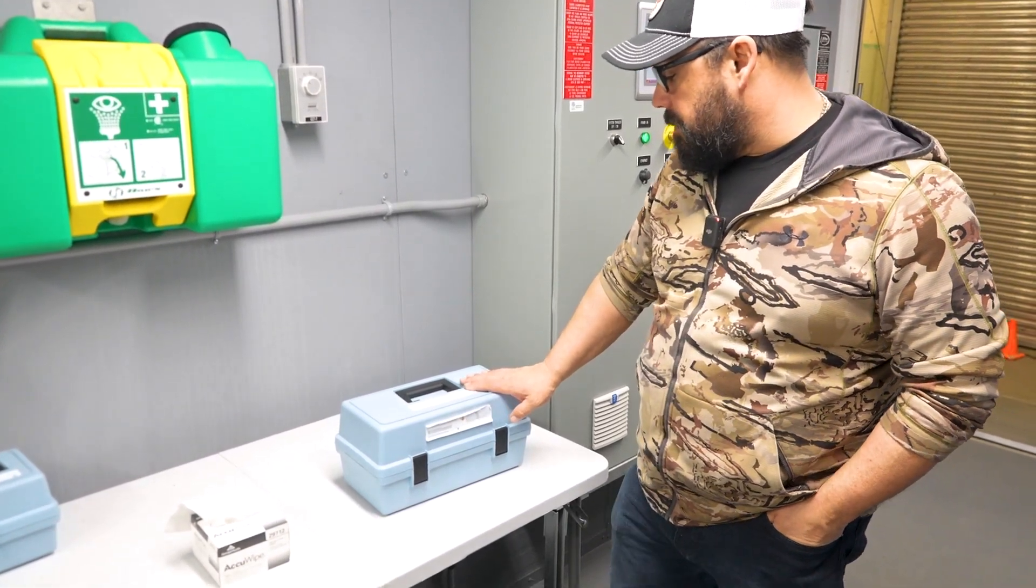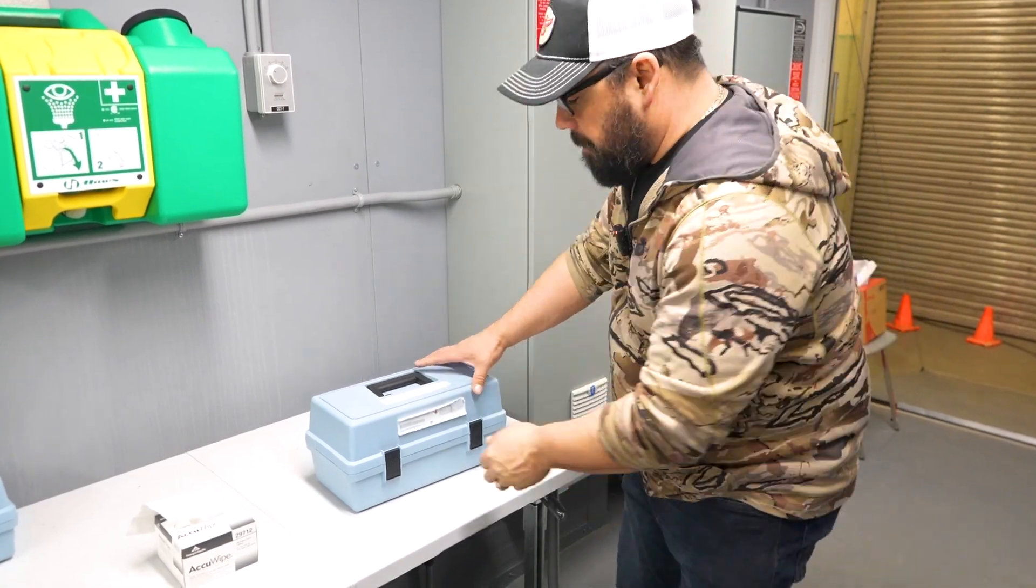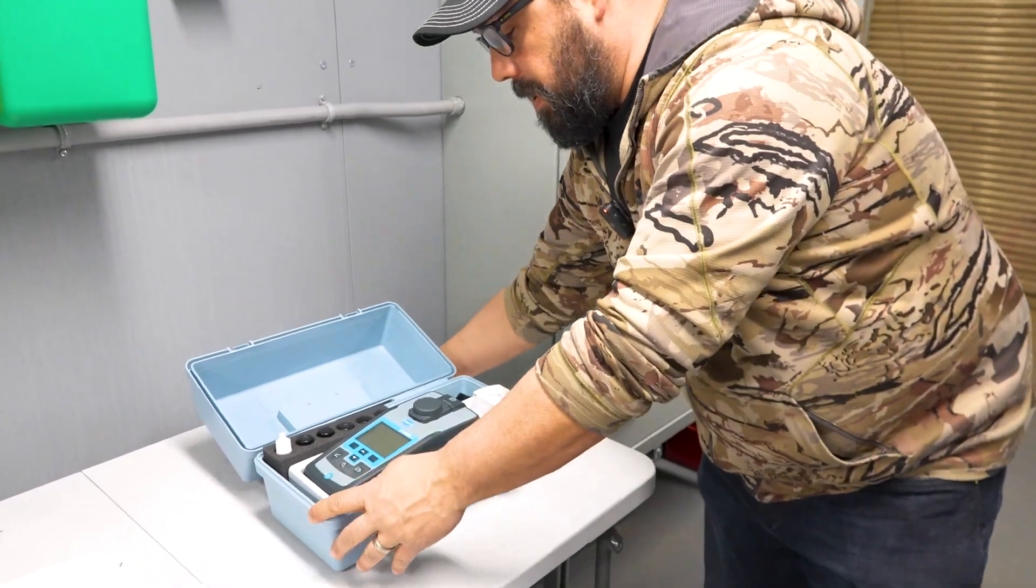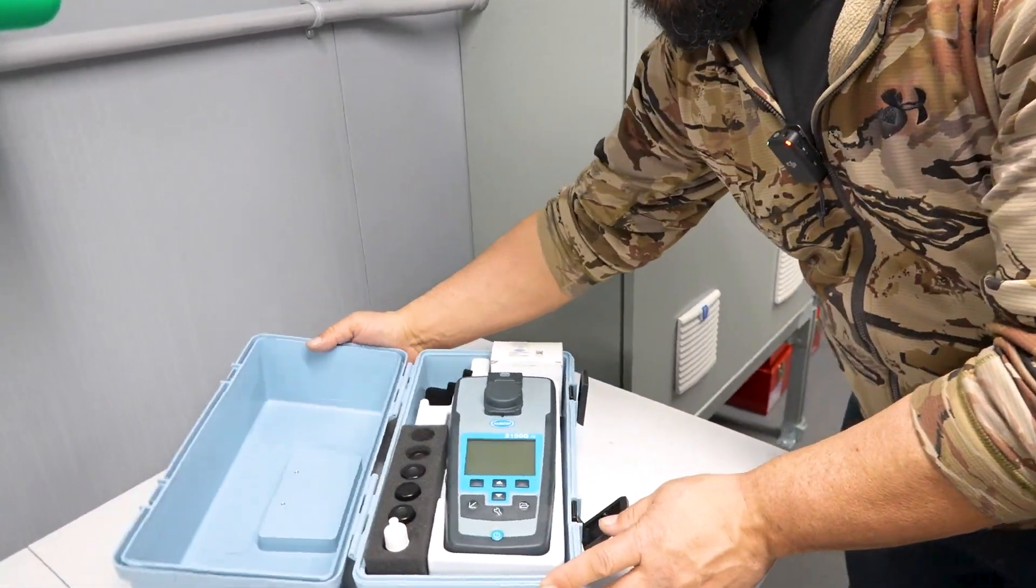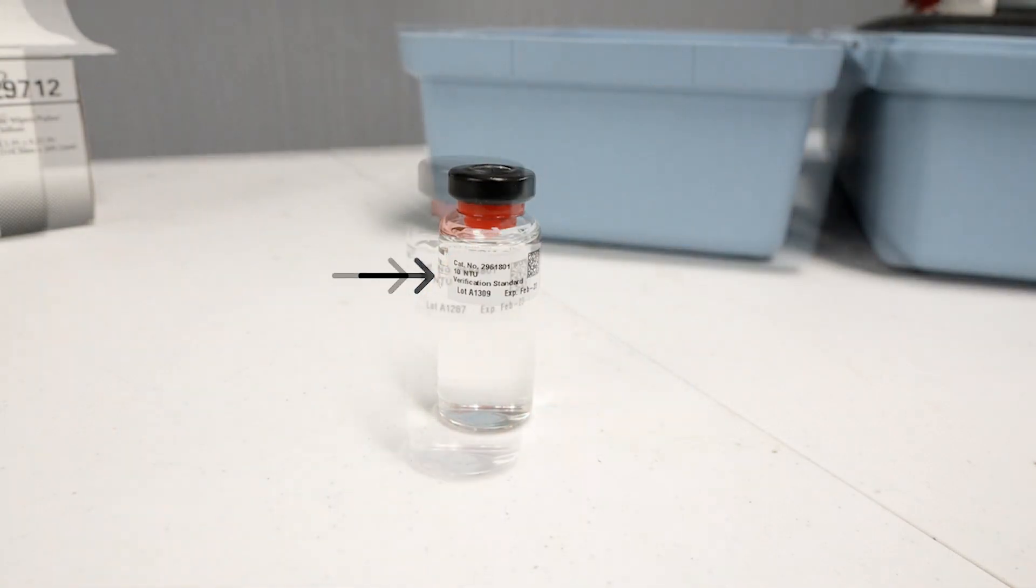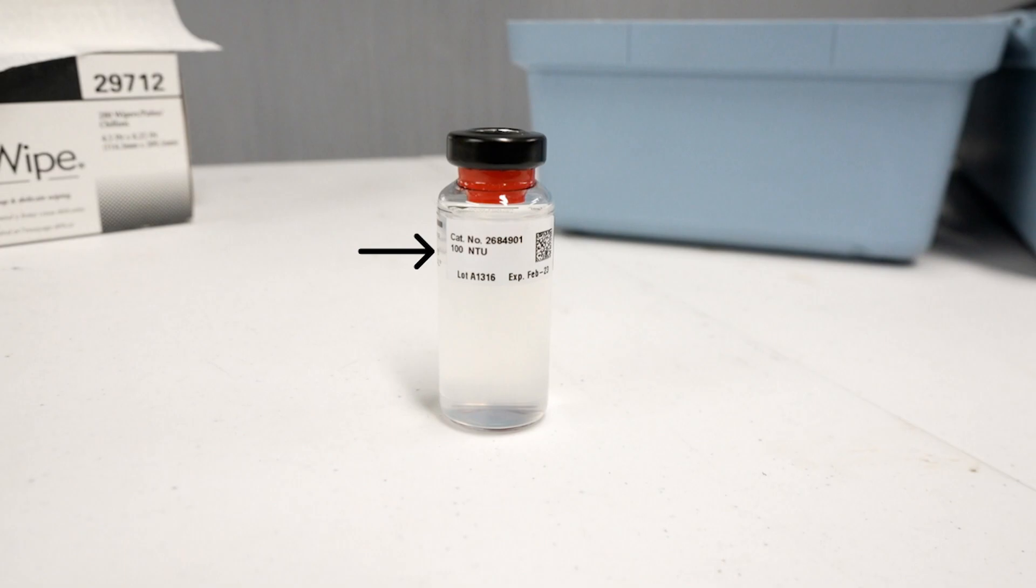We're going to discuss the calibration of the 2100Q Portable Turbidity Meter from HACC. First we've got to open the box up, and we have our turbidity meter in here. Now this turbidity meter has standards as well. We'll have a 10 NTU, we have a 20 NTU, a 100 NTU reading, and an 800 NTU reading.